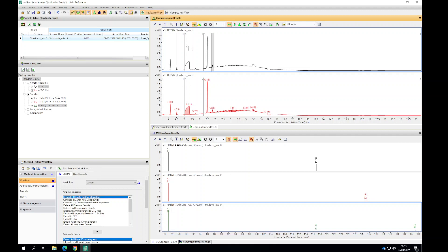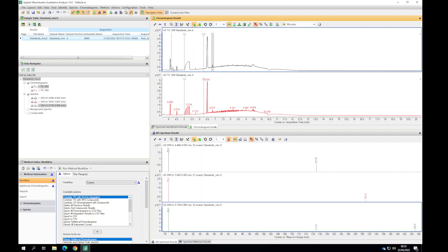Then we created time segments where the mass spec is only looking for particular ions. It's a selected ion monitoring approach and everything else is ignored. You can still see there's some other peaks potentially from the derivatization agent that do come up, and now we take this information and build it into a quant method.